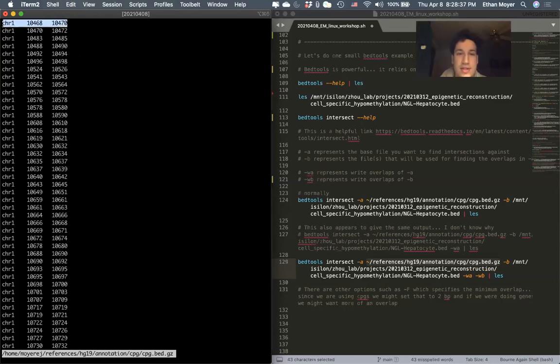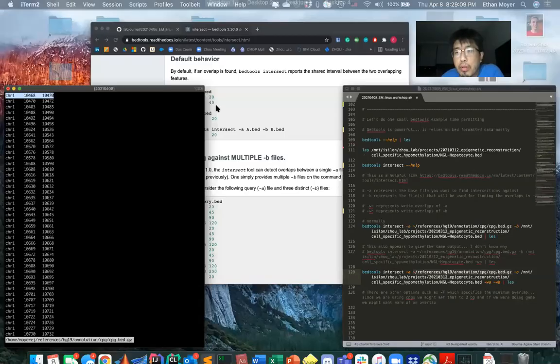He's asking about the CG nomenclature versus this nomenclature. Why are you asking why you need 3 columns? Oh no, why you need 3 spaces? Like the first row, 10,468, the next should be 469 and 470. So there's 3 spaces. But we only need CpG, like cytosine and guanine, like 2.